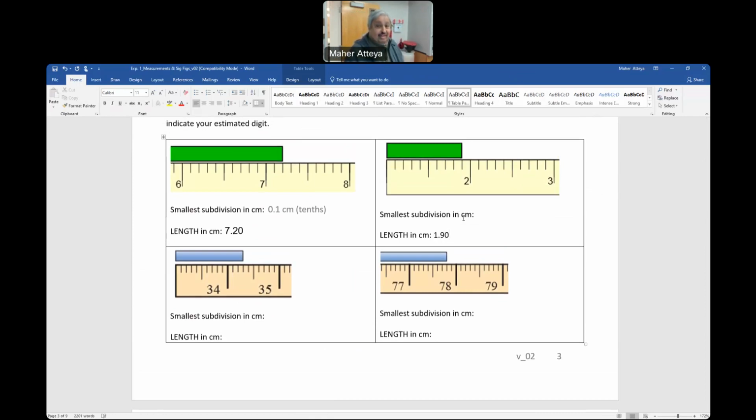Now somebody will say, well, Dr. Atey, how about 1.99? You are estimating the last digit. You are not certain if it's 1.95, 1.90, or 1.89. So I will go for 1.90.